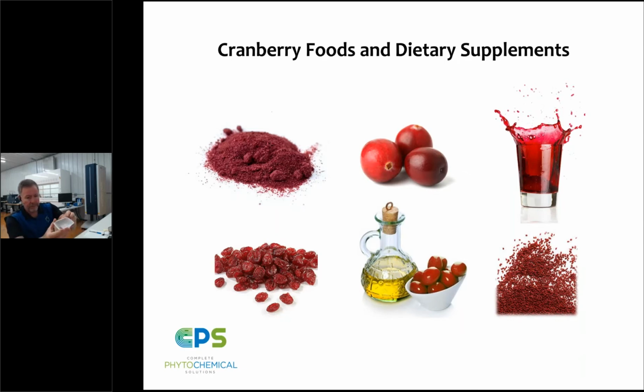And then I also have an example of some capsules. In these capsules, you can place the raw powder either alone as cranberry standalone or in combination with other ingredients. So very often we are asked to validate the authenticity of the cranberry at each and every one of these stages, at a juice concentrate stage, at a dietary fiber ingredient stage, in a filled capsule, in a final finished bottle product in the marketplace. As you'll see from the PowerPoint presentation here, there's a number of different products that are represented, all the way from a juice, sweetened dried cranberries, whole fruits, dried ingredients, oils extracted from seed.